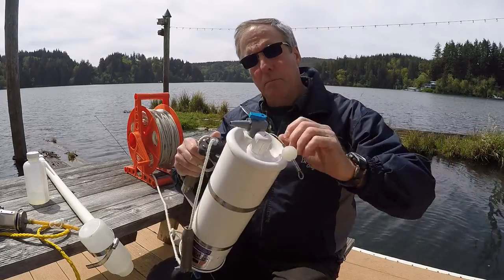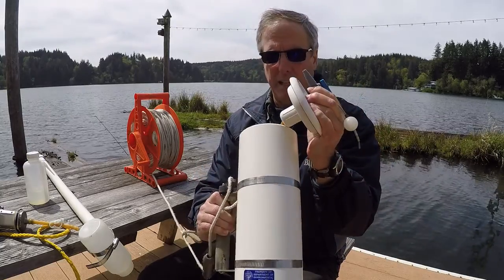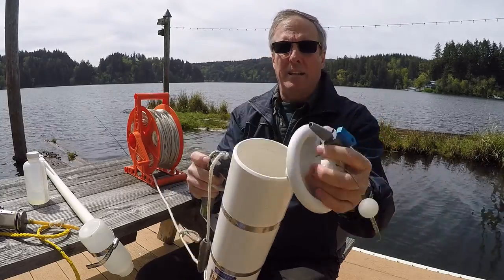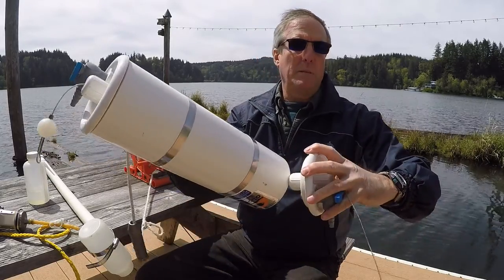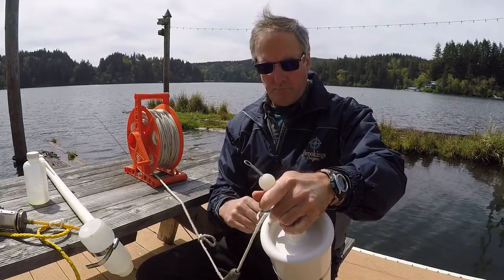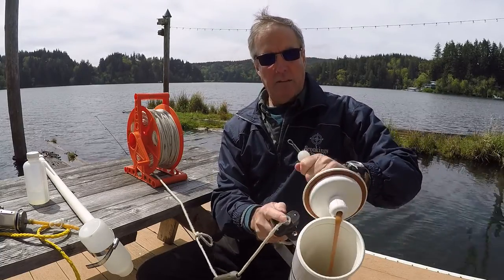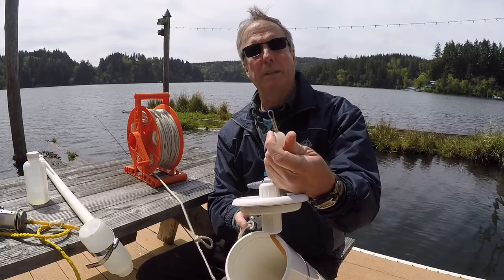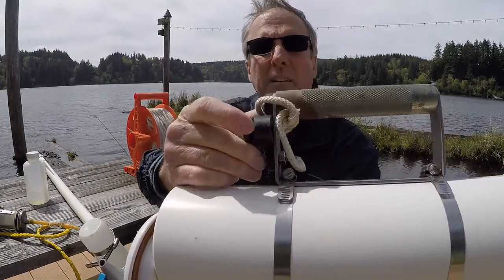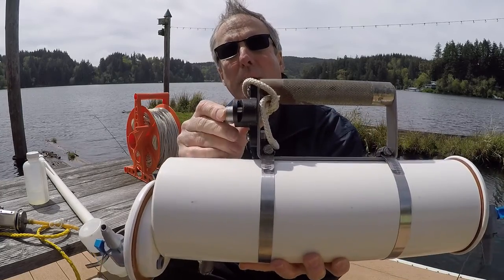As you can see, it's got a couple of end caps on it. There's a rubbery hose that actually connects the two end caps together, and so both of them come off. And so the way it works is you take both of them off, and it has this little metal loop at the end, and right in here there's a pin, and when I go like that, you can see the pin inside here, that little silver pin moves.